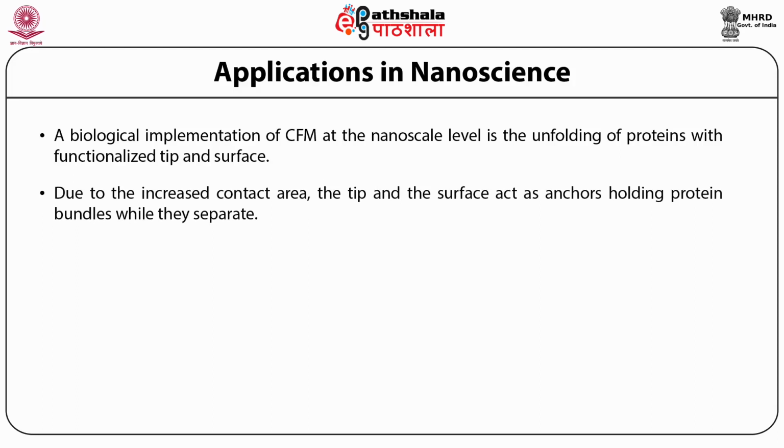The tip and the surface act as anchors holding protein bundles while they separate. As uncoiling ensues, the force required jumps, indicating various stages of uncoiling. This happens in stages: first, separation into bundles; then bundle separation into domains of crystalline proteins held together by van der Waals forces; and third, linearization of protein upon overcoming these secondary bonding.